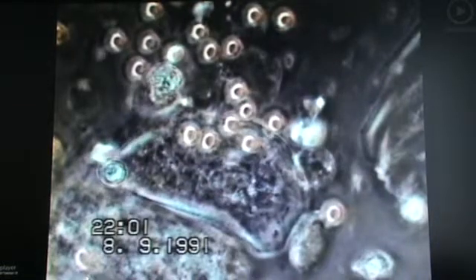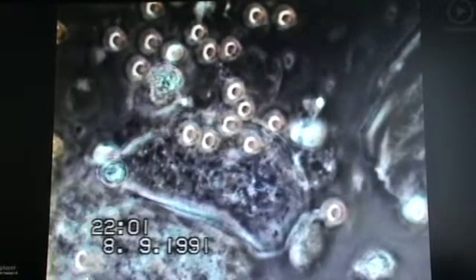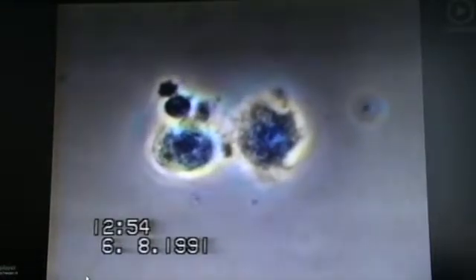This dividing tumour cell, on the above left of the picture, is currently being attacked by killer cells. On the above right of this picture, you can see a solitary tumour cell, about 25 micrometers in diameter, that is in a nutrient solution. Here, some dividing tumour cells are being attacked by killer cells.